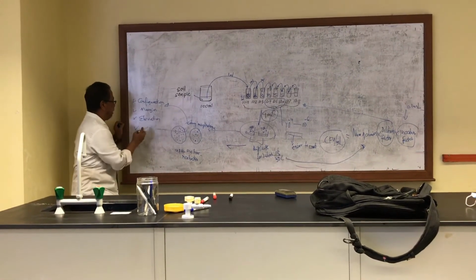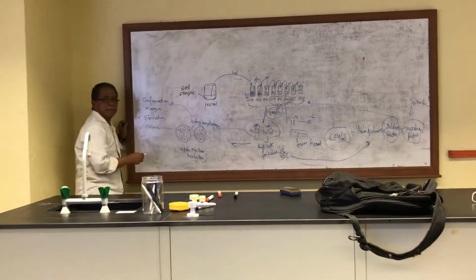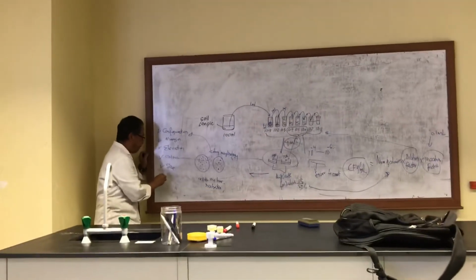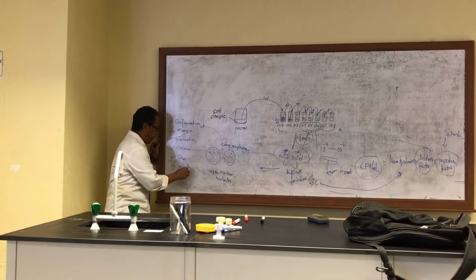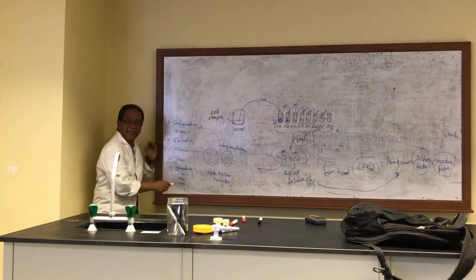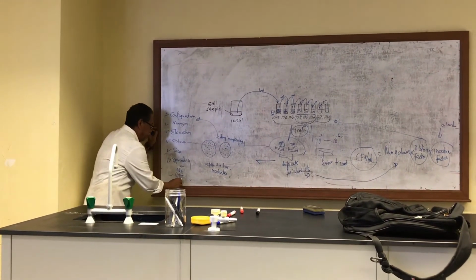Then try to see the color and the size, and see whether it's spreading in the plate or not. Sometimes they are very slimy.